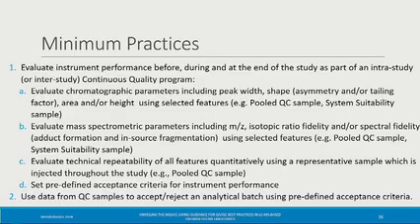Yeah, and just to add, another problem that I see with pooling prior to extraction is that, for example, in our lab, many times we have serum samples from premature babies where you have 30 microliters, and then of course you have a higher volume after extraction, so it's just easier to pool afterwards. Yes, my lab faces similar issues. We work a lot with small samples, where we also have very limited volumes, so I 100% agree.